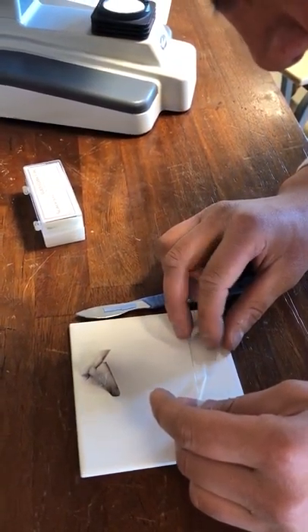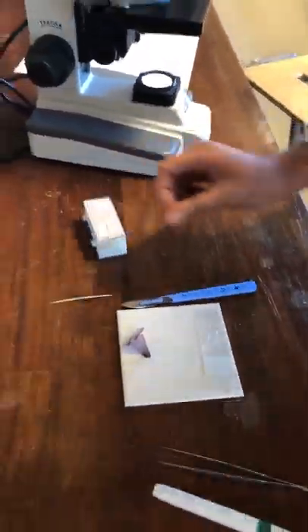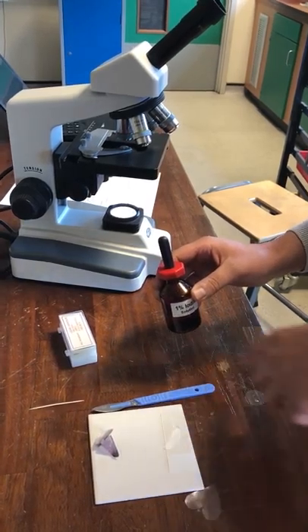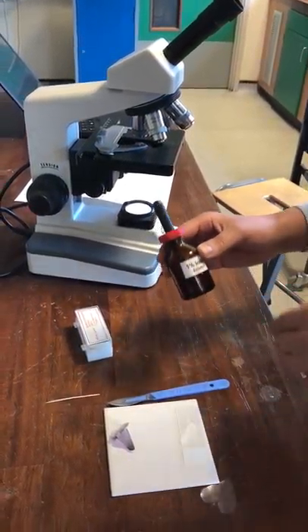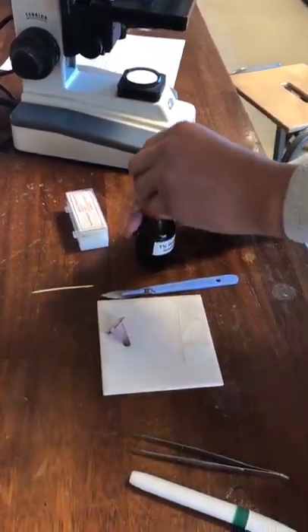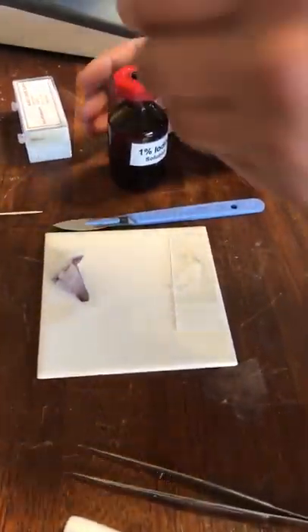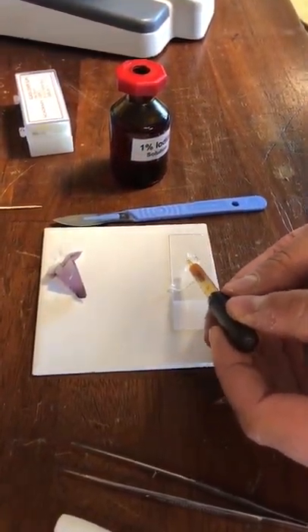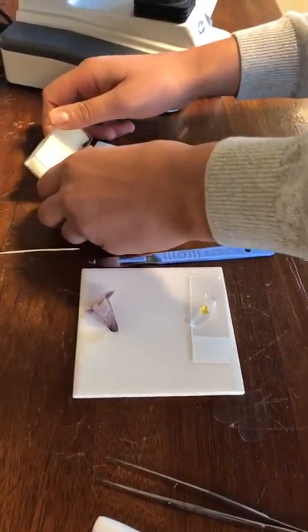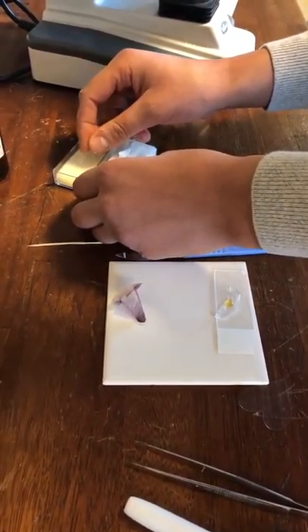Next up, you want to stain it so you're able to see it nice and clearly under the microscope. Otherwise you won't be able to pick out the different parts of the cell — the organelles. We're going to use iodine one percent, and we don't need a lot; just a drop will do. If you're feeling greedy put two, but I always put one.